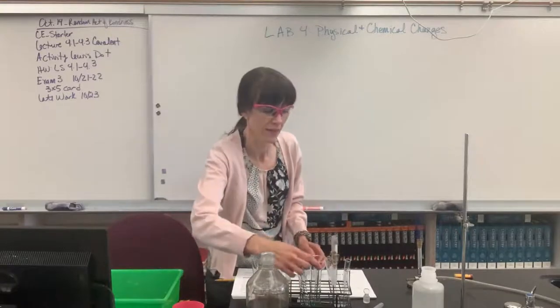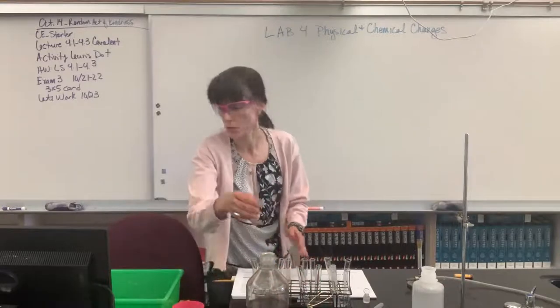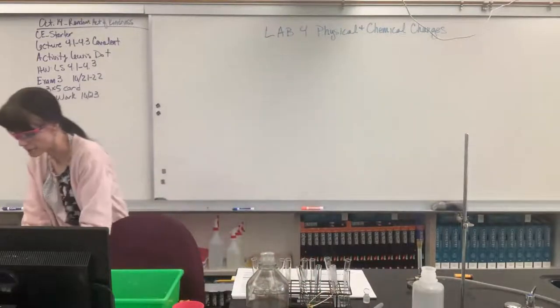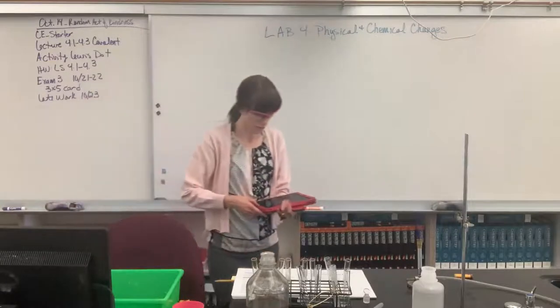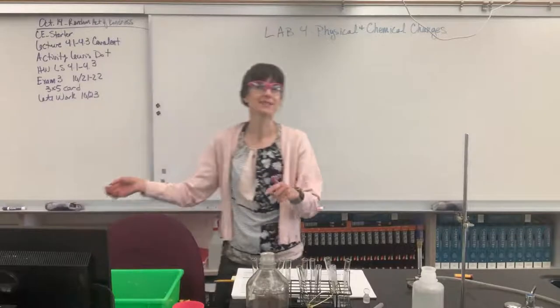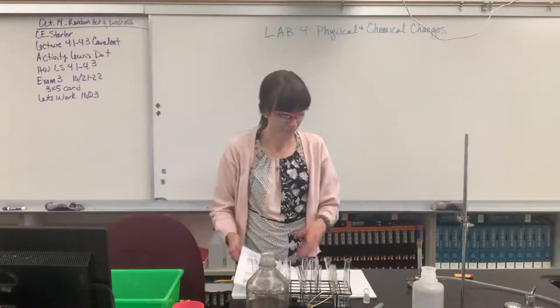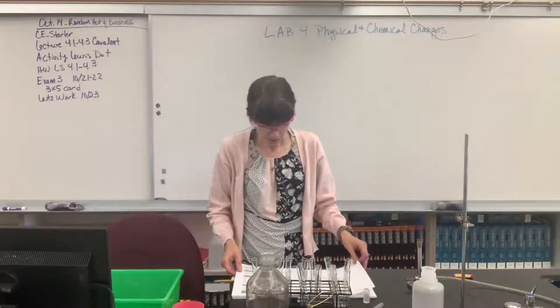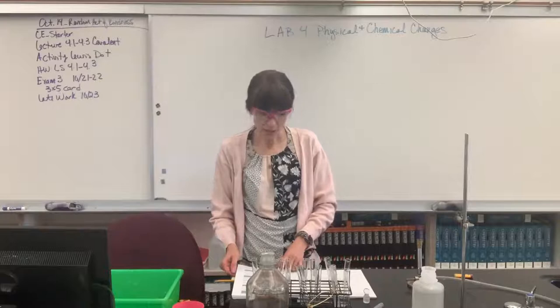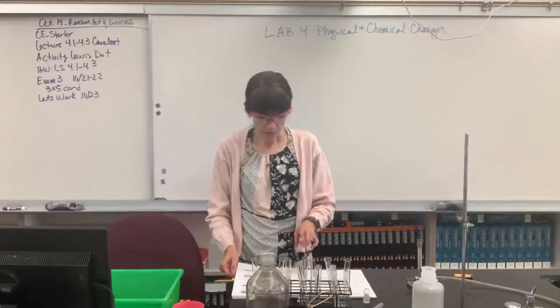Okay, I'm going to let that sit for just a minute to cool. I'm hoping you can see this, the smoke, the steam coming off of that. Okay, our timer just went off, which means we can finish parts B and C. If you will go back with me to part B.